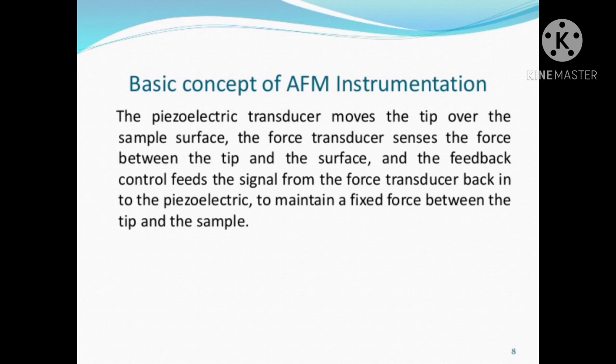Next is the basic concept of AFM instrumentation. The piezoelectric transducer moves the tip over the sample surface. The force transducer senses the force between the tip and the surface, and the feedback control feeds the signal from the force transducer back into the piezoelectric to maintain a fixed force between the tip and the sample.